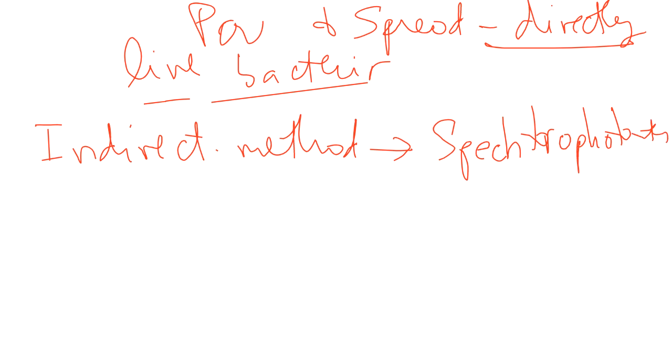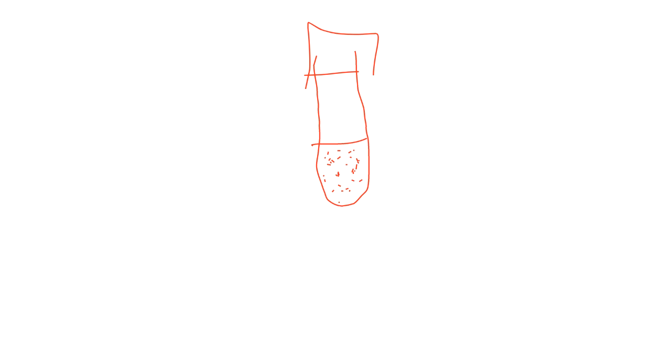All right, it's just a spec for short, actually. And this is what the machine is going to do. If you have a sample of bacteria, notice that when you have a broth of bacteria, the broth is cloudy. So what the machine is going to do is shine light through the sample. Actually, it makes the light go through a prism, which separates the light, and you shine on your sample whichever wavelength you want. But let's simplify things.